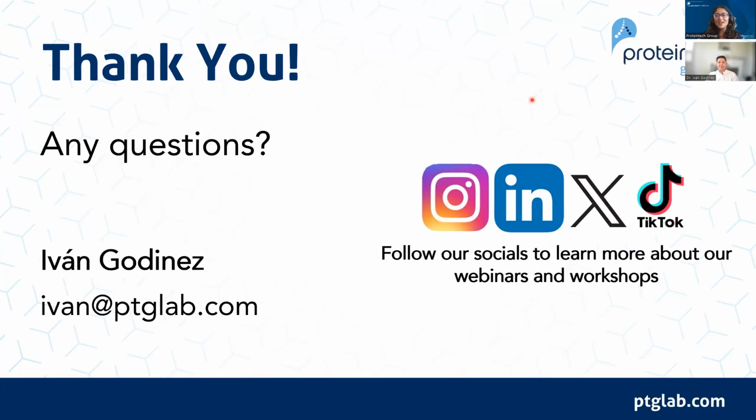Great, thanks. And then we just had a question come in asking, are you able to perform cell/nuclei hashing with intracellular CITE-seq? Great question. For those of you that don't know, hashing is a way of increasing multiplexing capabilities on top of the Flex inline barcoding system that 10x has developed. So the short answer is yes. You can use cell surface epitopes to help drive cell hashing. As I mentioned earlier, we do screening against fixed epitopes, so we're looking right now to develop and release a cell hashing kit that will work with both fixed and live cells. So yes, it's something you can do.